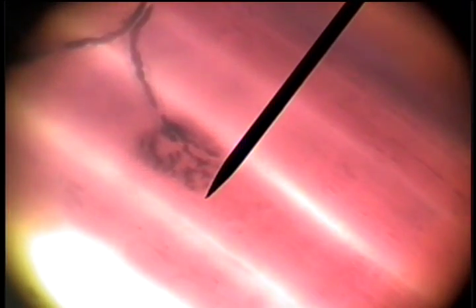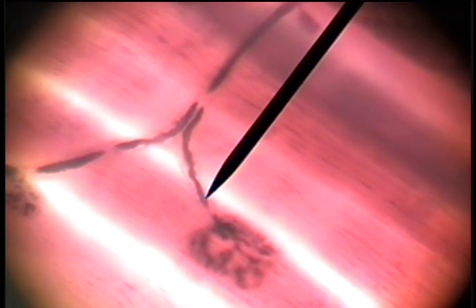If we look on higher power, we can see that the nerve tip separates out into these little finger-shaped structures. Also note that this is a myelinated nerve, and just before it enters the fingers or boutons, as they're called, the fiber becomes a non-myelinated nerve fiber. Motor end plate or myoneural junction.